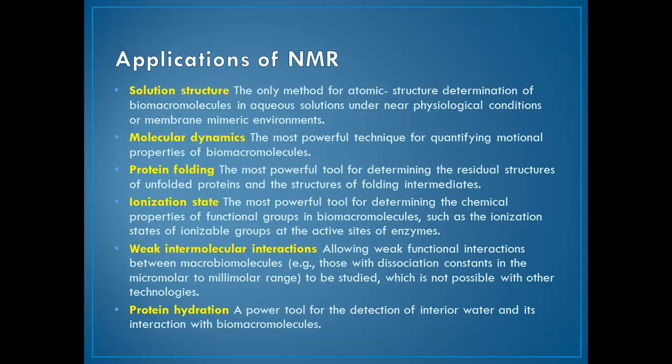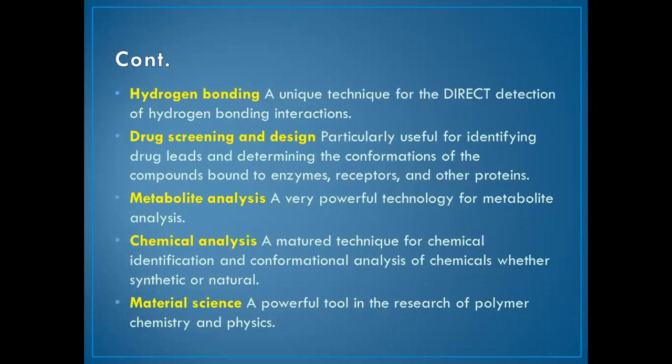And the next is protein hydration, a powerful tool for the detection of interior water and its interaction with biomacromolecules. And hydrogen bonding, a unique technique for the direct detection of hydrogen bonding interactions. Drug screening and design, particularly useful for identifying drug leads and determining the conformations of compounds bound to enzymes, receptors, and other proteins. Metabolite analysis, a very powerful technology for metabolite analysis. Chemical analysis, a mature technique for chemical identification and conformational analysis of chemicals, whether synthetic or natural.